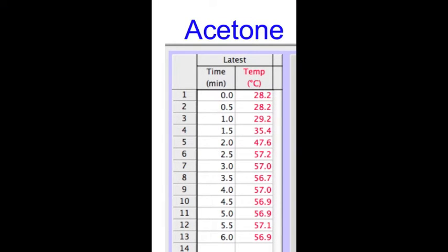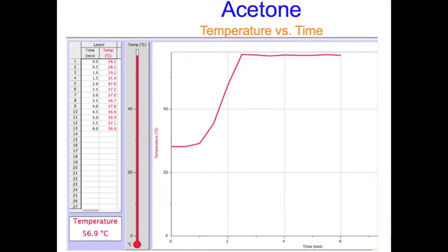Here, 50 milliliters of acetone was heated for 6 minutes. You can see the temperature increasing and eventually leveling off at the boiling point. Here is a graph of that data.